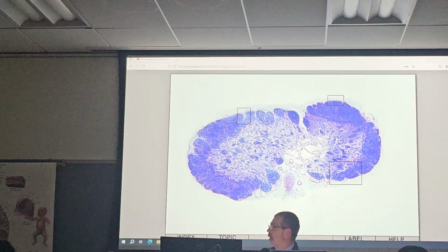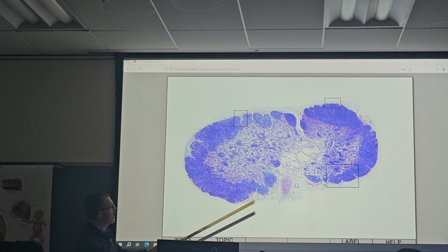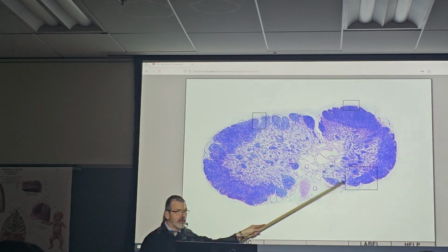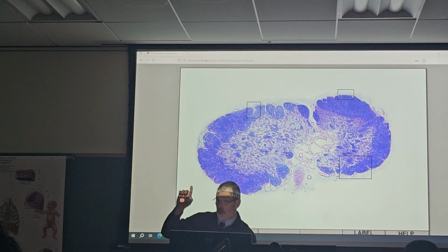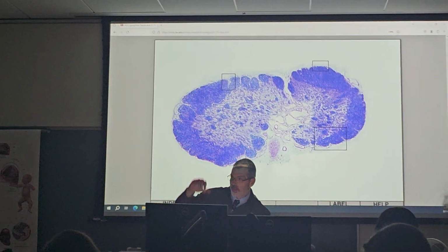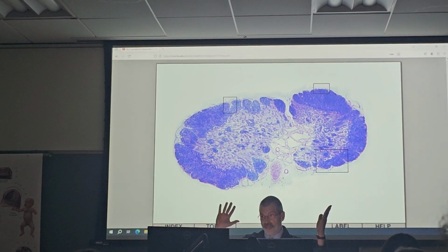Give me a second. Oop. I lost the internet. Different slide. If you just look for the light and the dark, you will see dark kind of here, light kind of here. No. Our slides are crummy. They're not nearly as pretty, but you can still see that layering. So light and dark rings, layers, lymph node. You're kind of done. That's that answer.